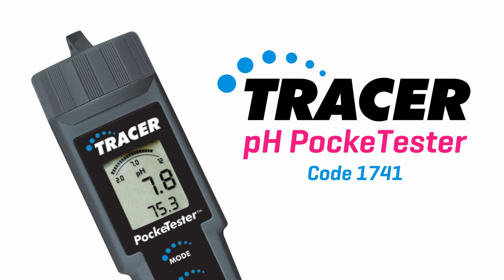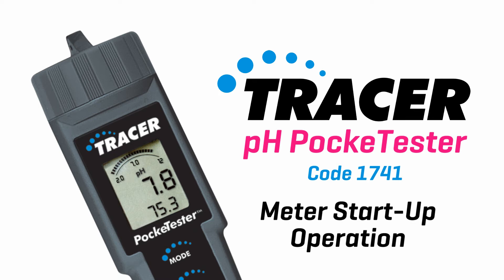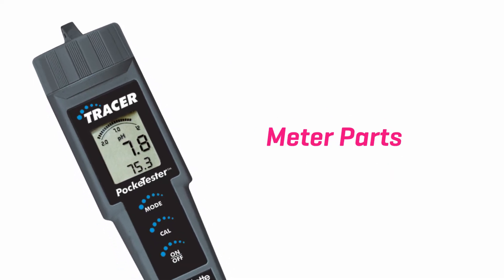pH pocket tester, code 1741. Meter startup operation. Meter parts.